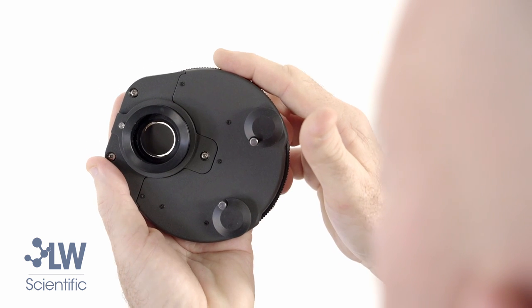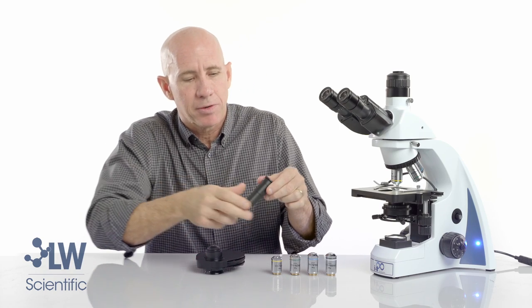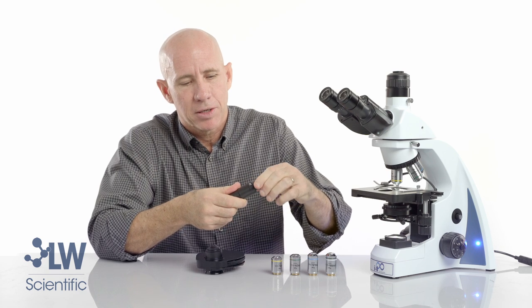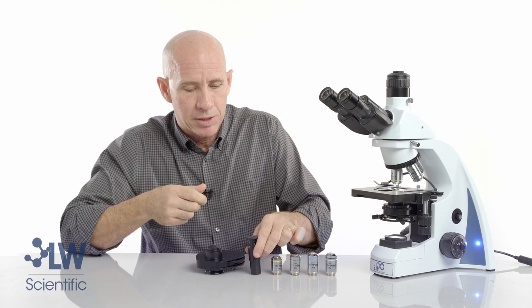There's even a dark field setting on this turret. And the last piece of the phase contrast kit is the centering telescoping eyepiece, which can become taller to allow you to visualize the annulus rings during the alignment process.